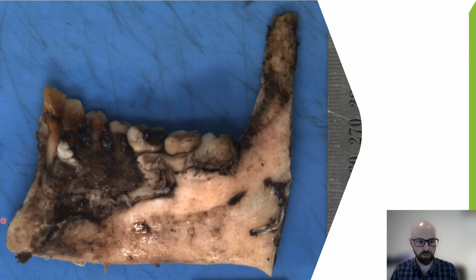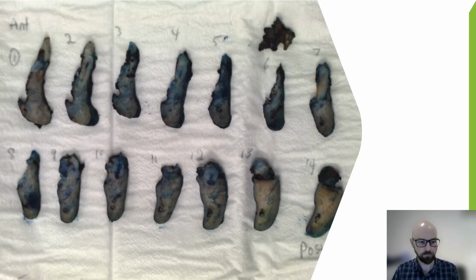And so that bone is then placed into decalcifying solution. A few weeks later, it's soft enough to cut. We've got it in serial sections here, and we can clearly see that there's a lot of bony destruction there from the tumour. But we do have to confirm that there is bone invasion histologically.